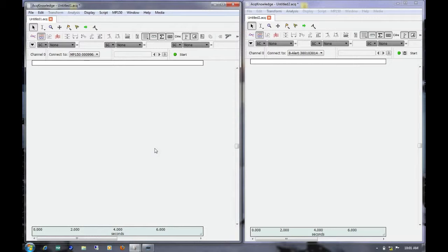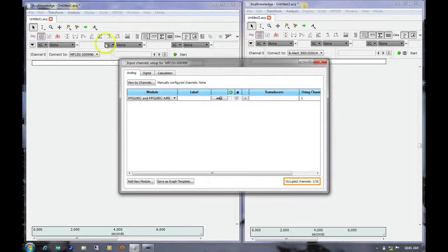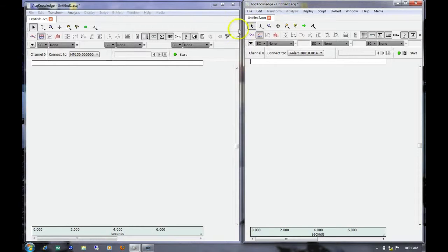To perform a Linked Acquisition, we first need to set up the graph windows for each of our recording devices. On the left, I have a window set up to record from the MP150 system, and it will be recording one channel of pulse data. On the right-hand side, I have the BeAlert window.